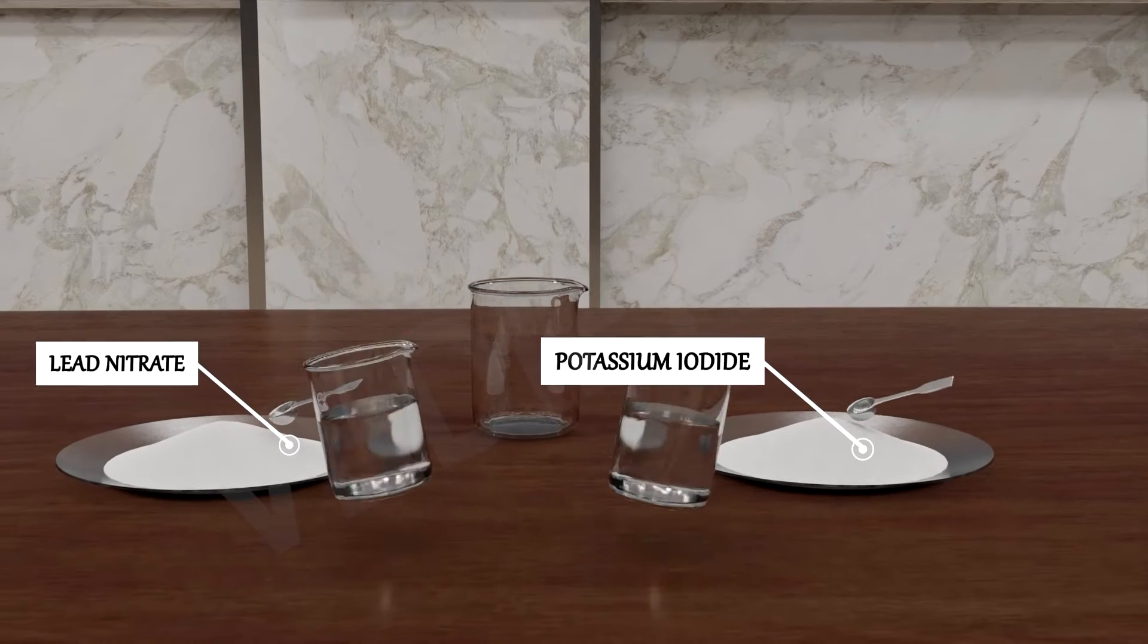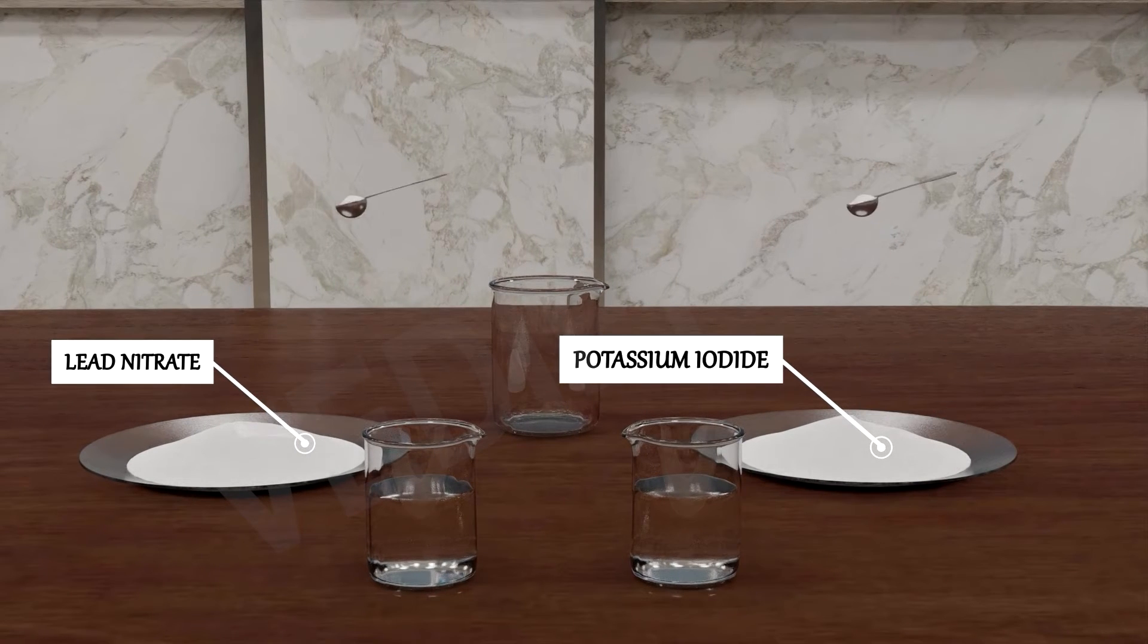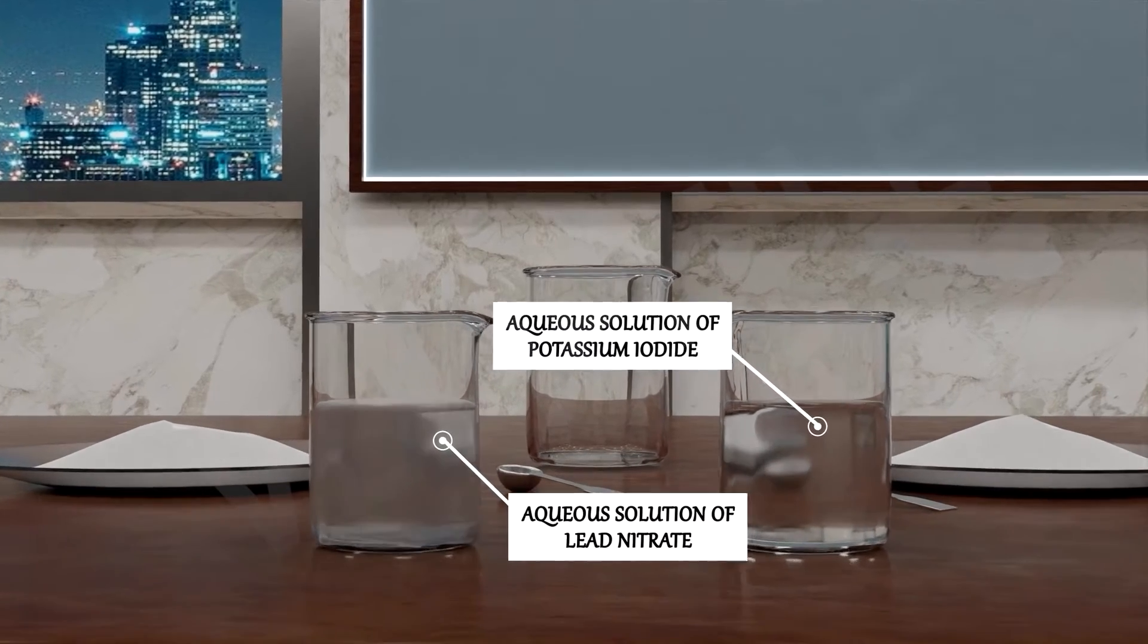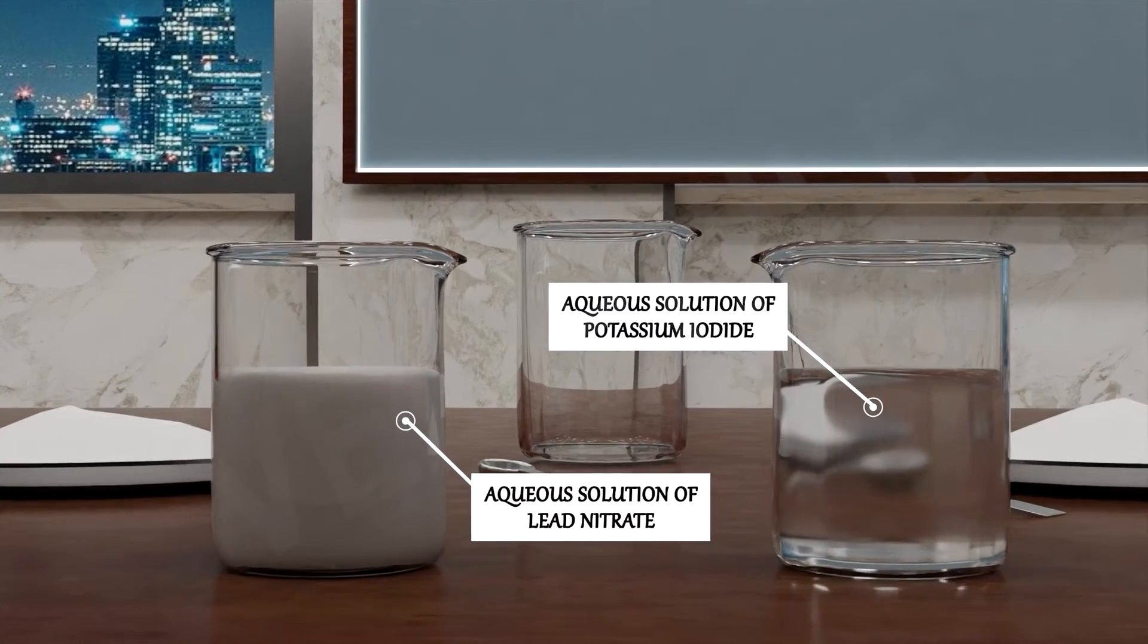Now we will dissolve both in water. So these are the aqueous solutions of lead nitrate and potassium iodide.